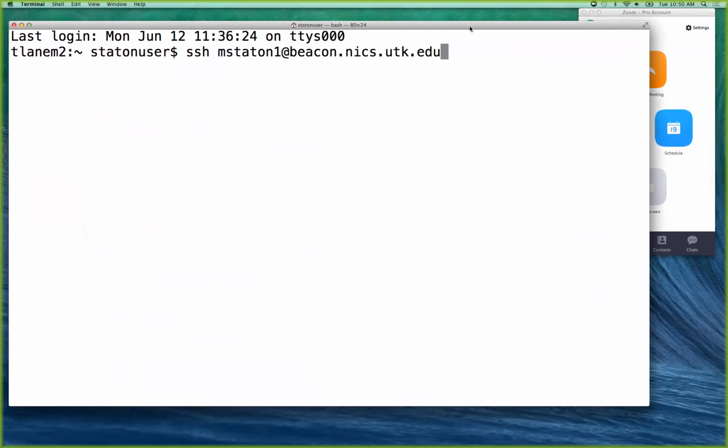Do you guys have any questions about software choices? Is there anything you've seen that you wonder, what do you think about this software package? Or I have a particular problem? If your reference is very distant from the organism you're sequencing, like Miriam works on blueberries where she sequences different species, we use different mappers. We're not going to cover these particularly well, the methodology behind the methods.